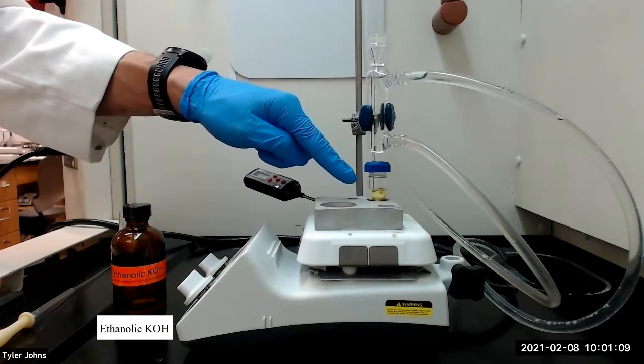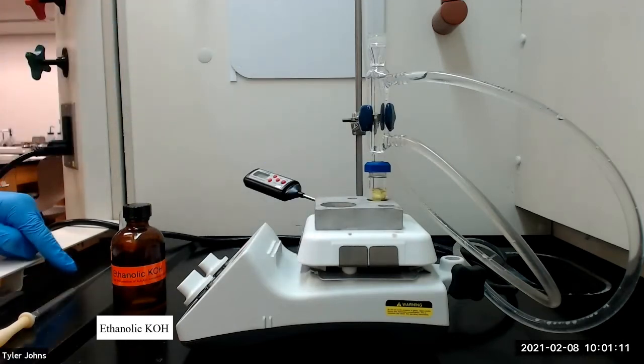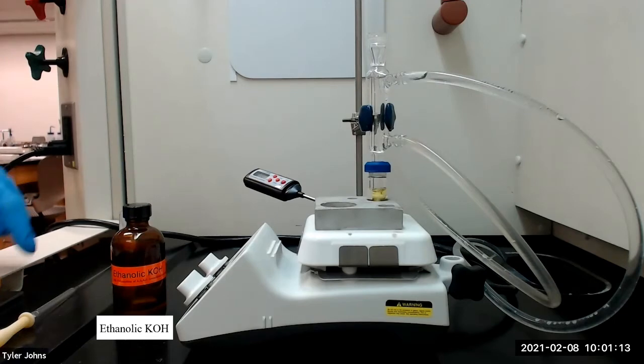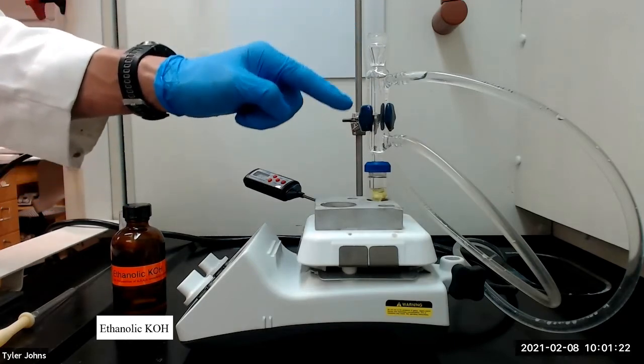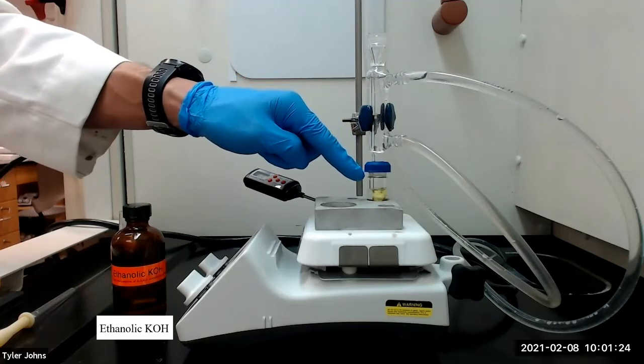Then with continuous stirring and using a 9-inch Pasteur pipette, we will carefully add dropwise 0.15 milliliters of ethanolic potassium hydroxide solution down through the water-cooled condenser into the vial.